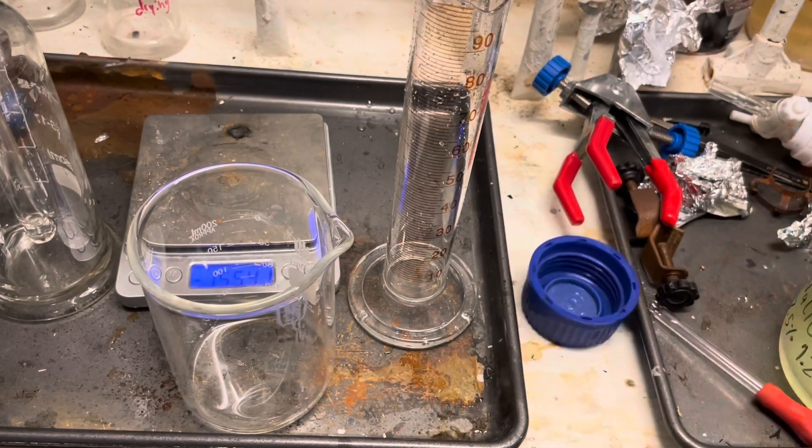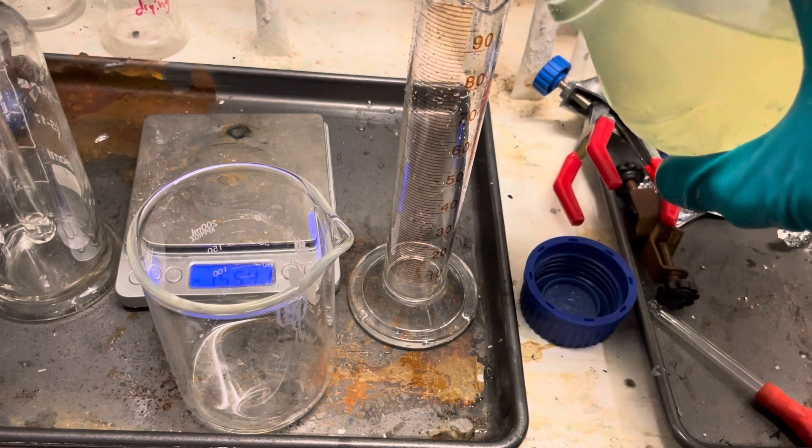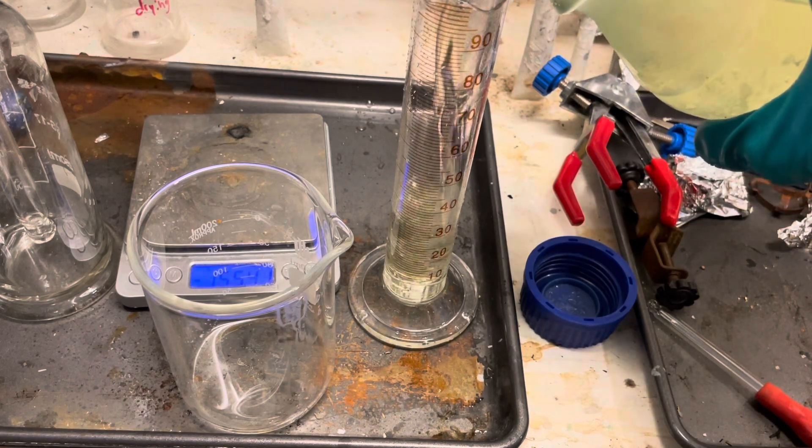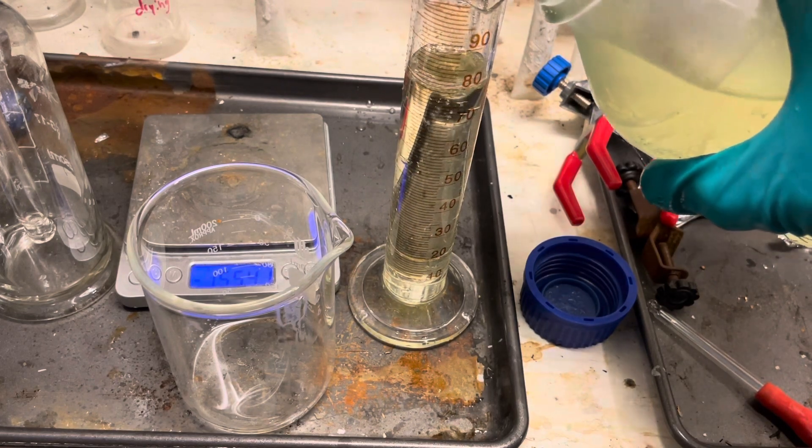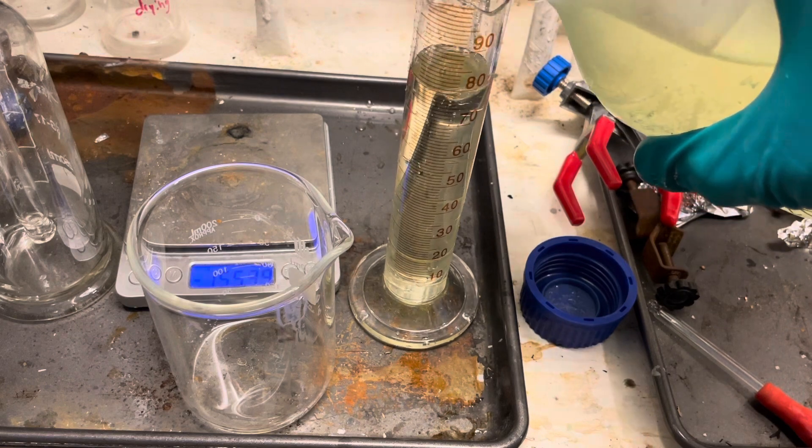For titrating, we're just going to use a random amount of bleach and put it in a graduated cylinder. We're simply going to pipette in bleach until we stop seeing nitrogen gas forming, very simple, and we'll record down how much bleach was used.